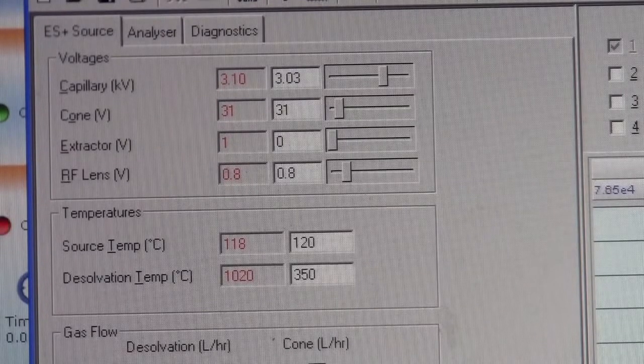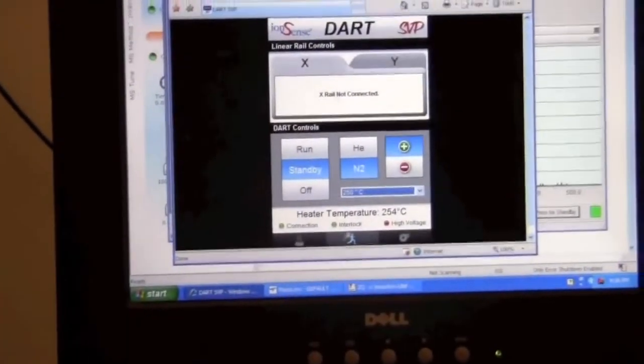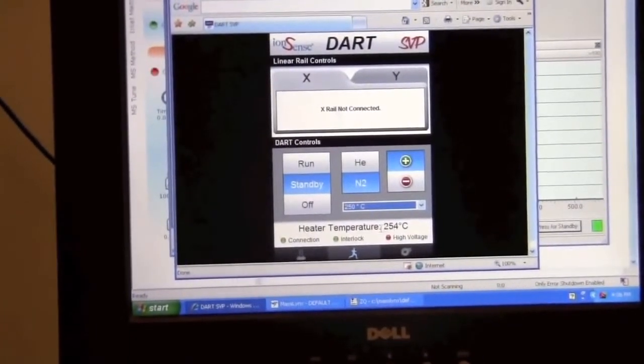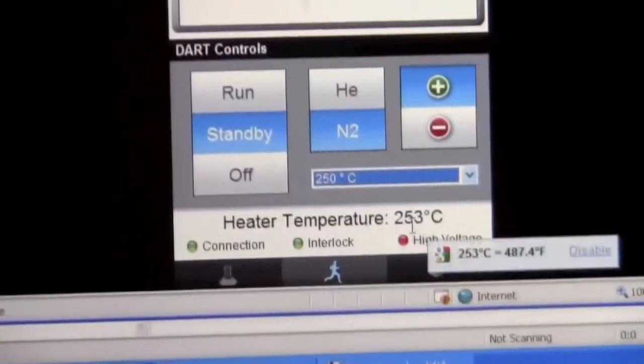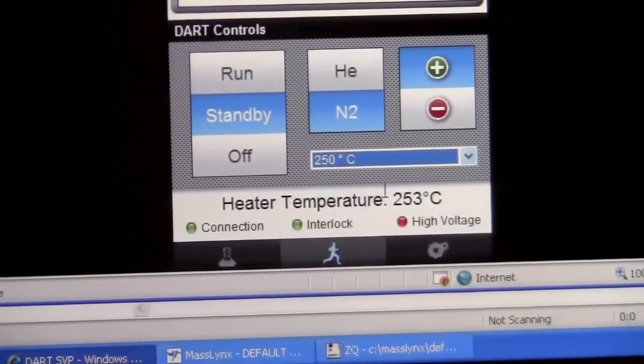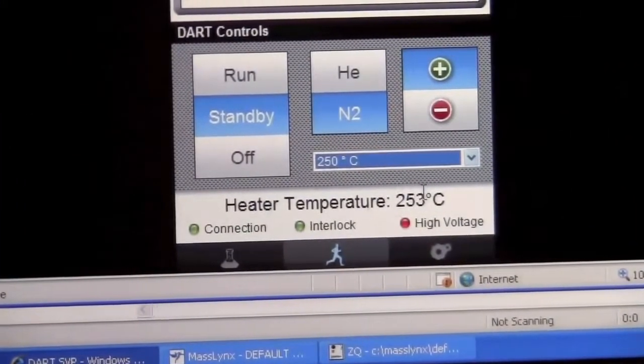Let's go back to the DART source and see how it's doing. So the temperature has now reached our target temperature of about 250 degrees Celsius.